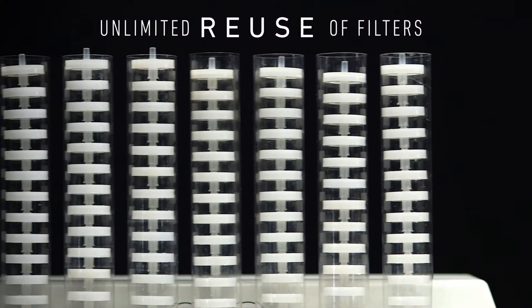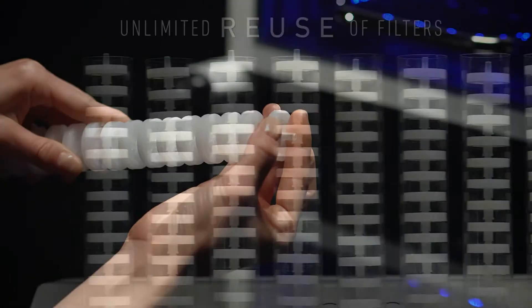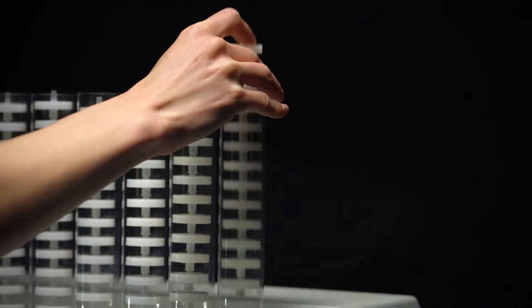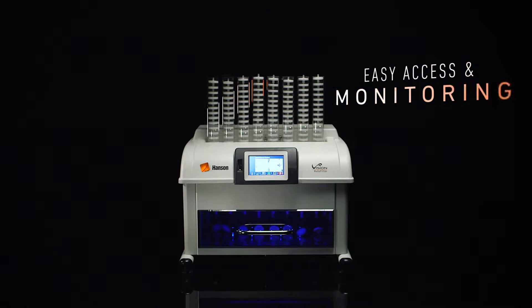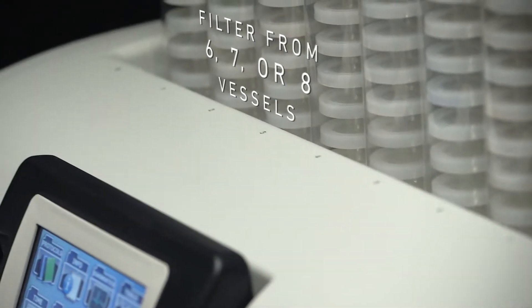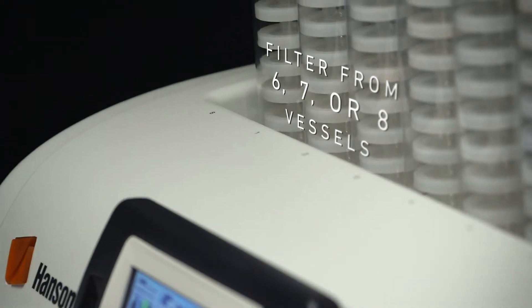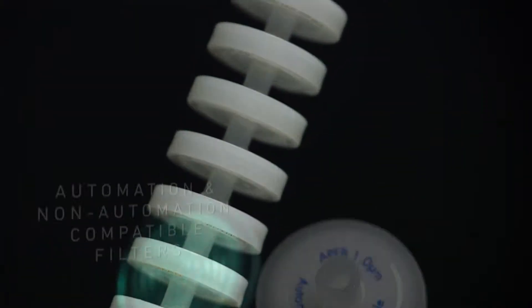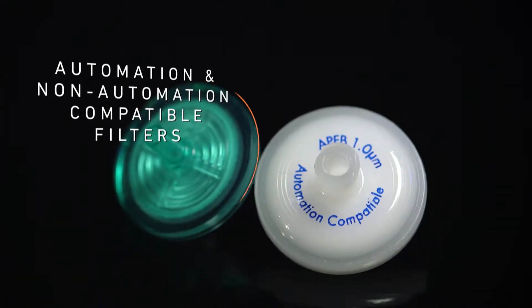Choose how many times to use the same filter. Simply stack filters together and insert them into each of the filter stack tubes, which are already lined up directly in front of you for easy access and monitoring. Choose to filter from six, seven, or eight vessels simultaneously.